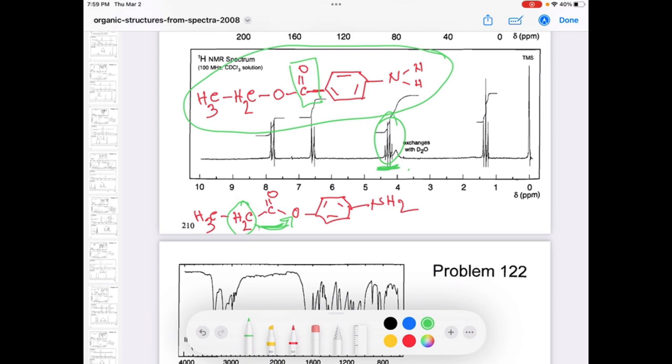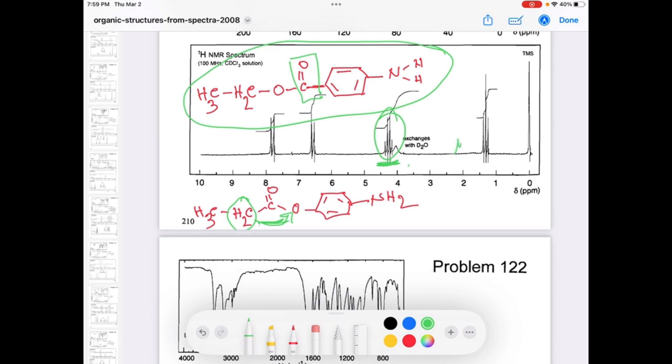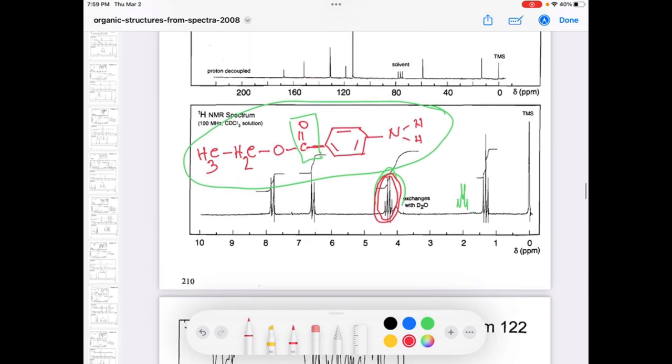So that quartet could come here like this. If that structure is correct, then you should see the quartet here, not there. So this is the signature peak in this NMR. In this molecule, this is the signature peak actually, this CH2 peak next to the oxygen. So this is the final structure.